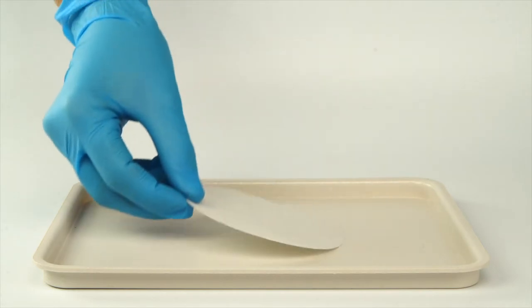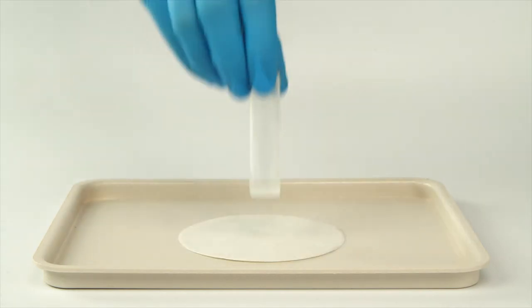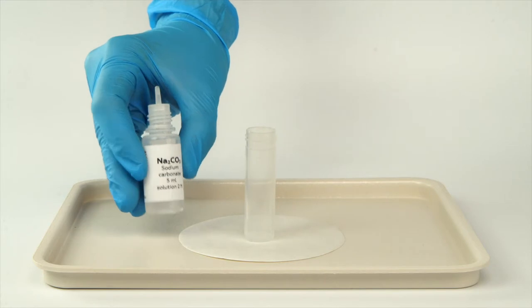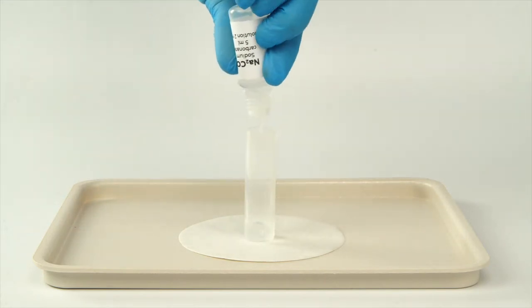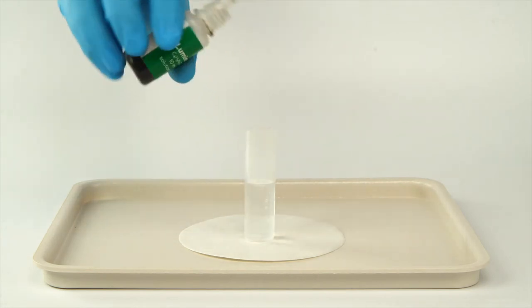First, prepare an alkaline luminol solution. Place your vial on your piece of filter paper. Pour one bottle of sodium carbonate solution into the vial. Add 15 drops of luminol solution.